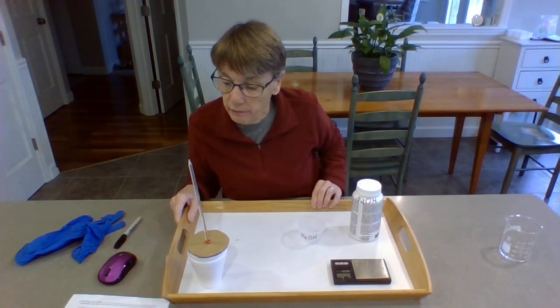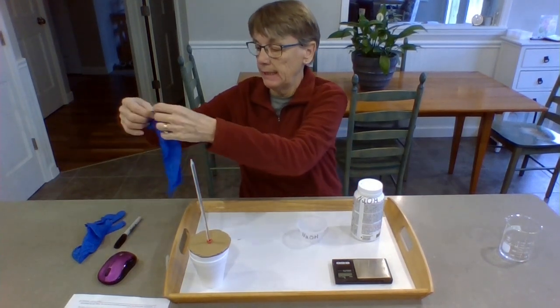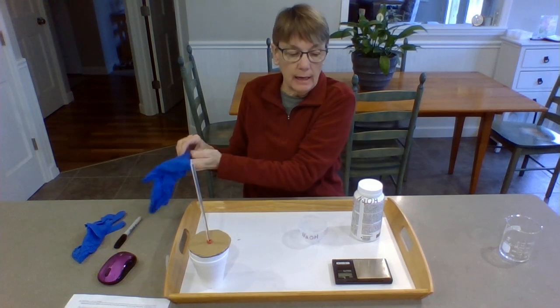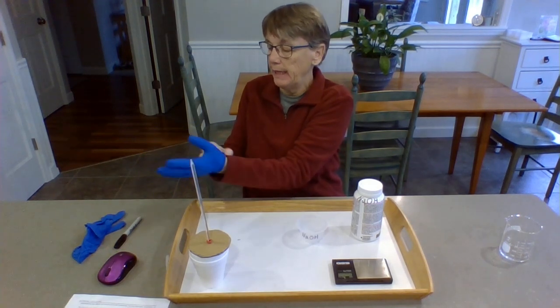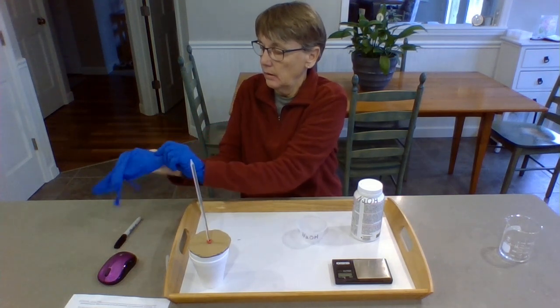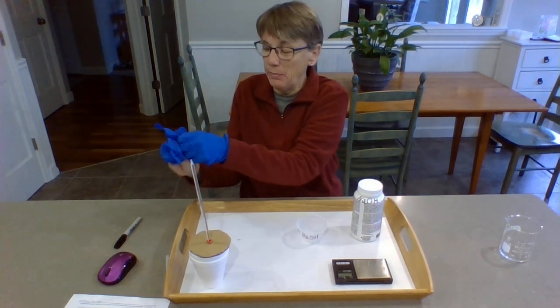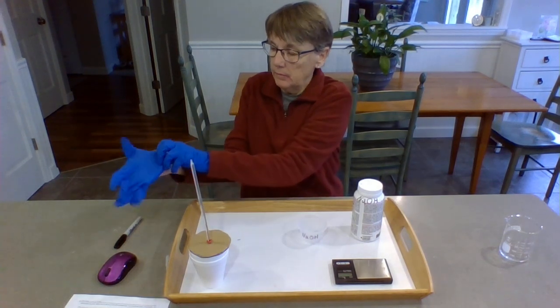Okay, so we're ready for step 7. I'm going to wear my gloves for this, because this is sodium hydroxide, which can burn your skin if you remember. I need to measure between 2.5 and 3.0 grams.